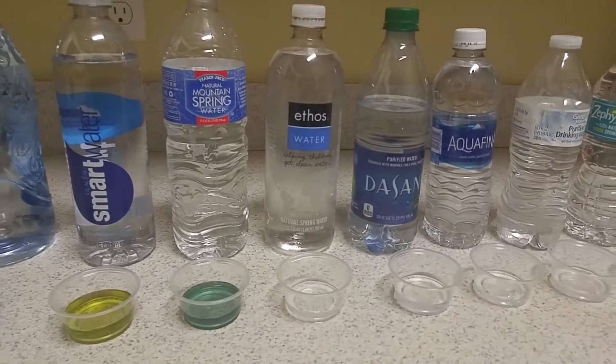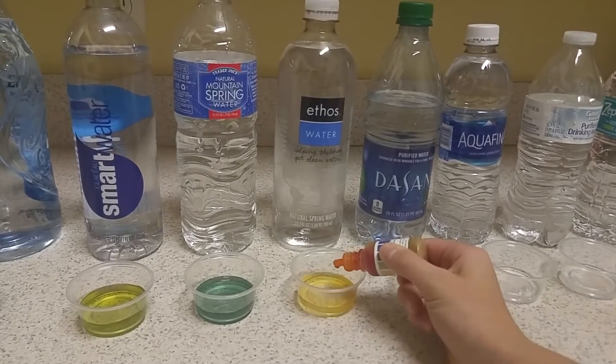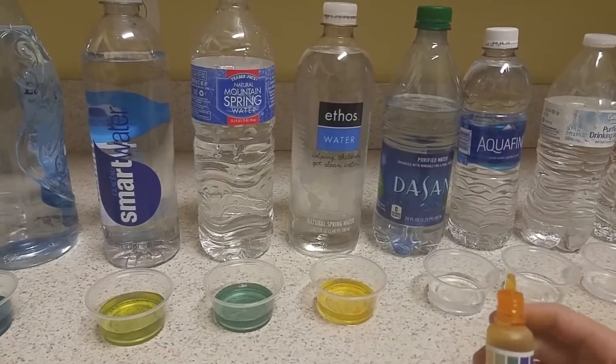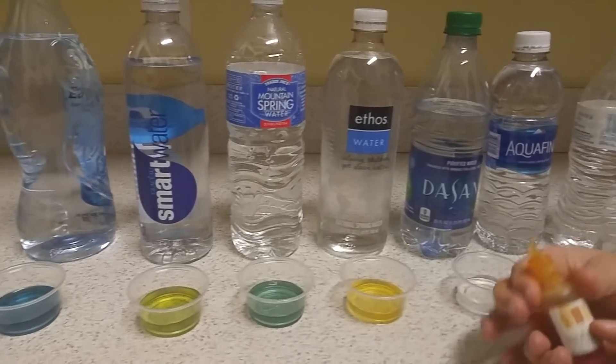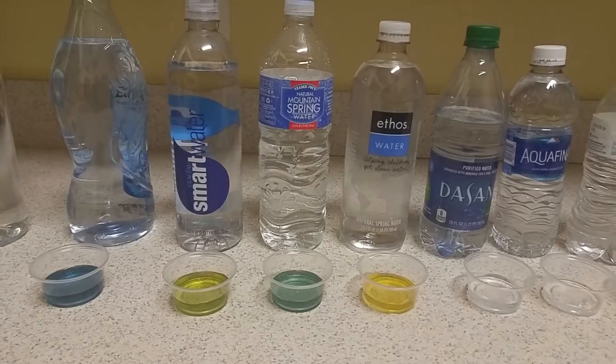Let's try the Starbucks brand Ethos Water. That's not good — not good at all. Sorry, Starbucks. That's worse — I think that's the worst one so far. Definitely the worst one so far.